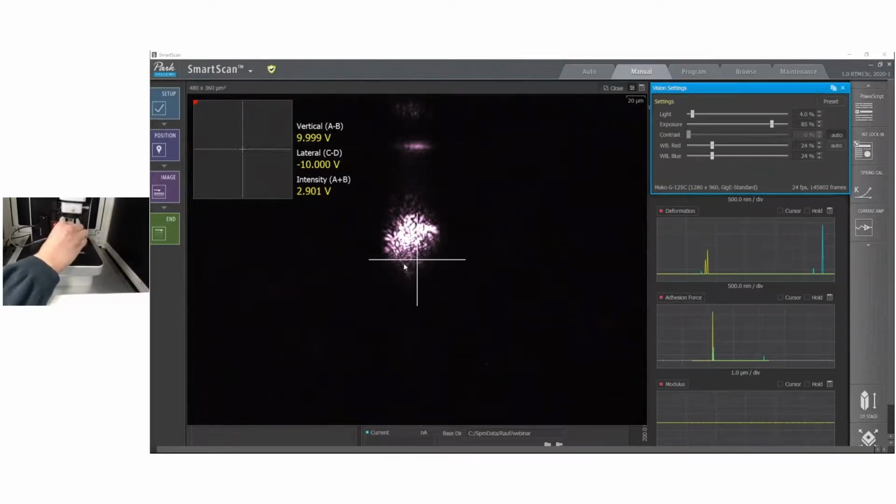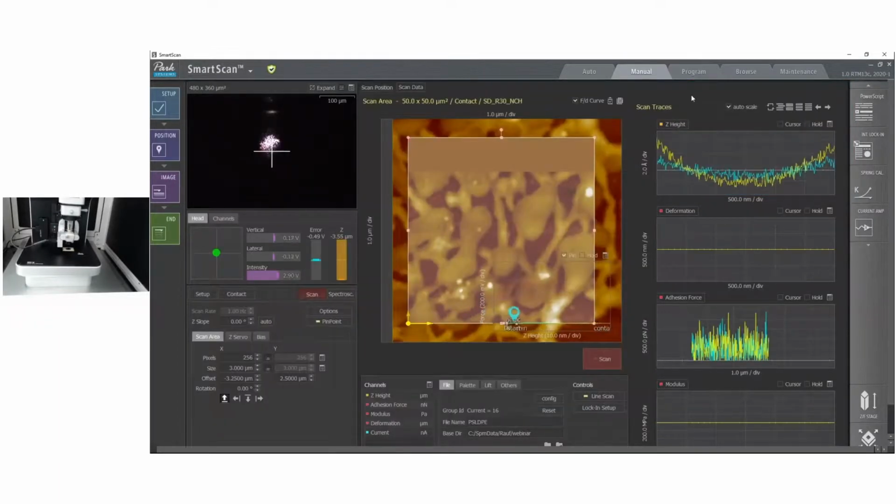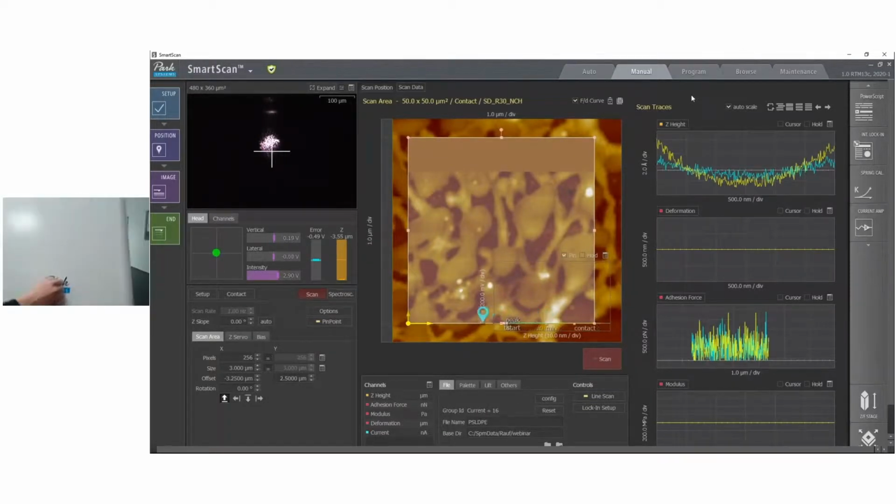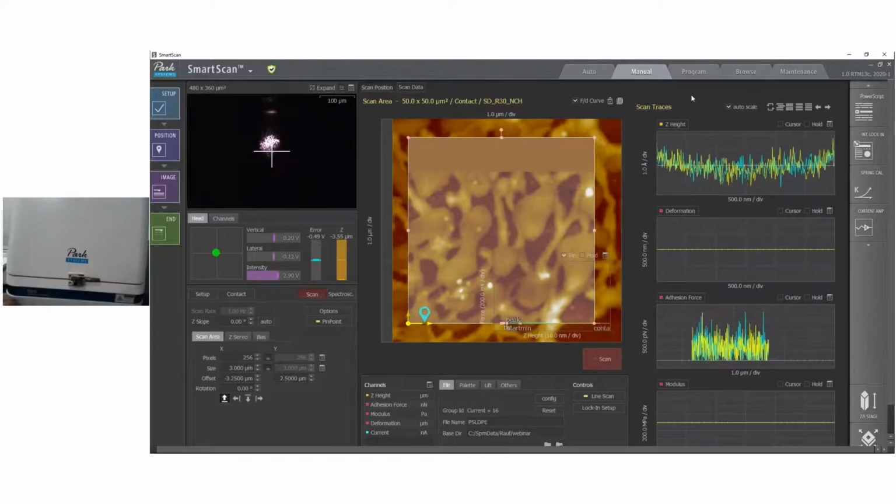And I can position the laser spot in the center of the PSPD by using the 2 screws on the head. It doesn't have to be perfectly 0.00. As soon as you see that this spot has turned green, you're good to go. So once I have done this, I can close the acoustic enclosure, and the rest I can control at the software. So I will turn off my camera now.